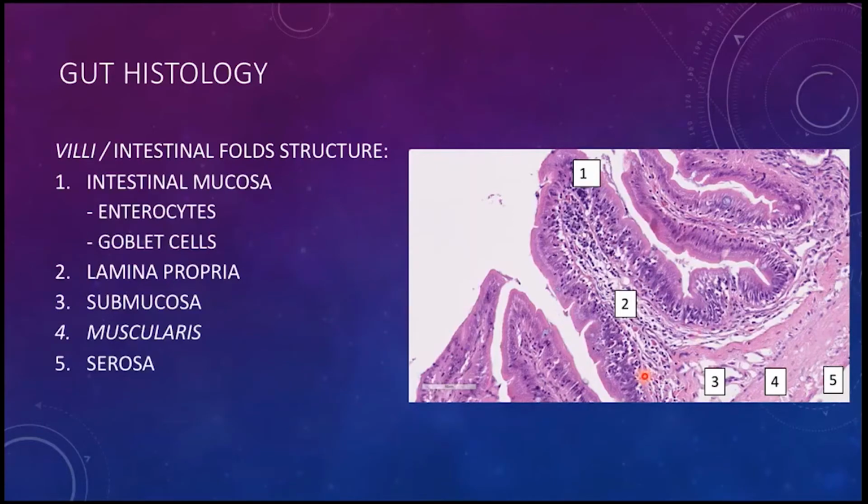Despite the intestine being in close contact with the external media, there is always lymphoid tissue ready to start a possible inflammatory response in case of exposure to strange antigens. There are two other layers, the muscularis layer and the serosa, that are the outermost layers and basically give the tube-like structure that the intestine has.